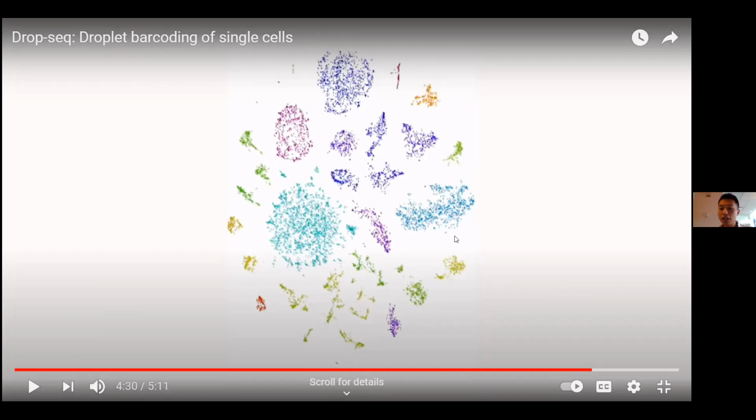And then we visually or mathematically differentiate these cells from those cells, such that we can regard each of the groups here as having the same identity, such that we can know their functionalities later on.